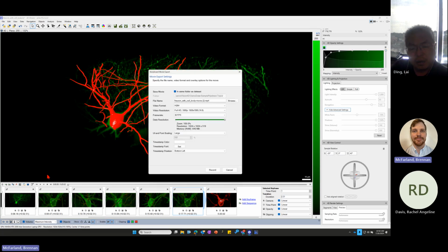Let's export movie here. What I would recommend is viewers will probably get a better experience, or be able to see the data better, and it'll look nicer to them by having a higher frame rate rather than a higher resolution. So you can start with 30 frames per second, but you may also benefit from using 60 frames per second, because the transitions will essentially have twice the amount of data between them.